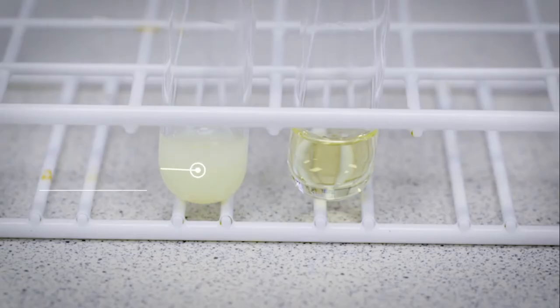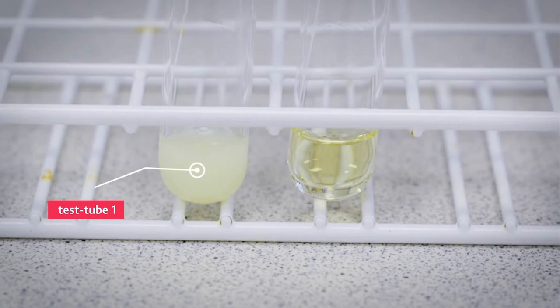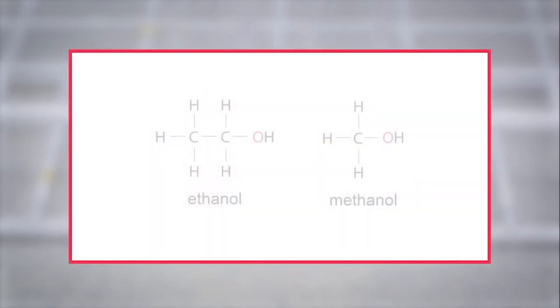In test tube 1, a pale yellow precipitate forms. In test tube 2, no precipitate forms. Ethanol contains a methyl carbinol group, giving a positive result. Methanol does not have a methyl carbinol group and gives a negative result.